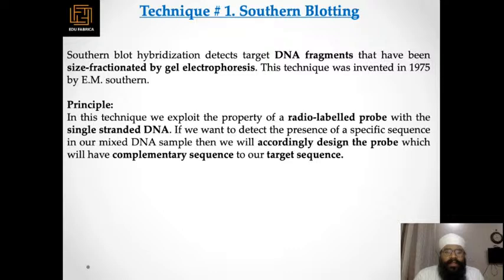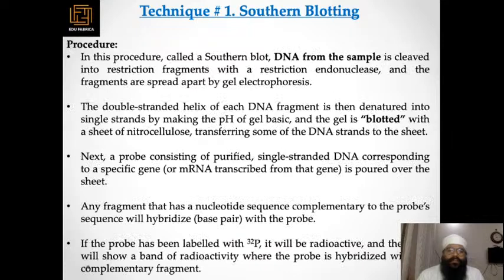In this technique, we exploit the property of a radiolabeled probe with a single-stranded DNA. If we want to detect the presence of a specific sequence in our mixed DNA samples, then we accordingly design the probe, which will have a complementary sequence to our target sequence.